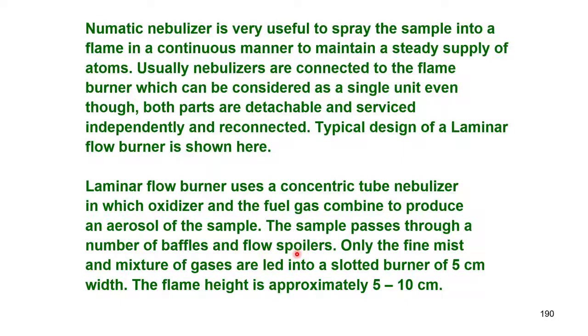So, what is a pneumatic nebulizer? The nebulizer is one which converts a liquid into a spray. A pneumatic nebulizer does it using air pressure. Okay. Because of the air pressure, it will push out the liquid and produce a spray.